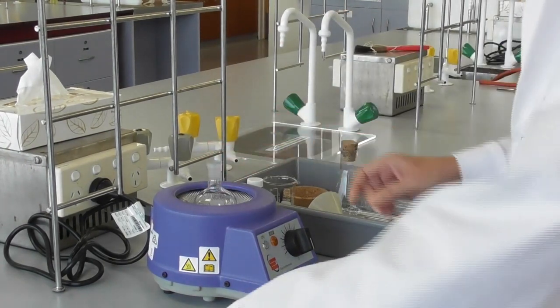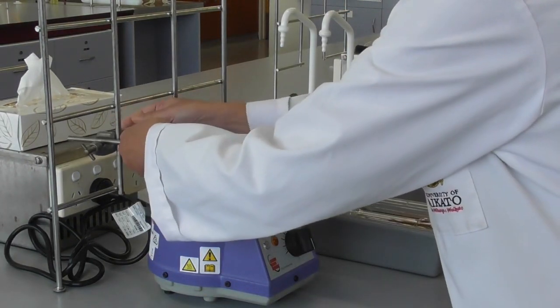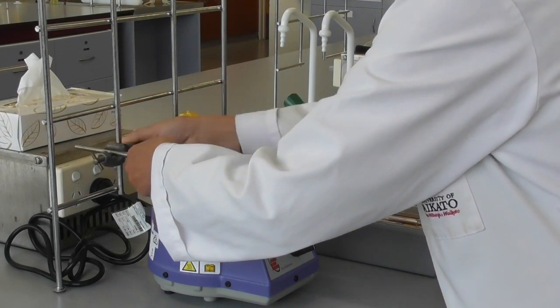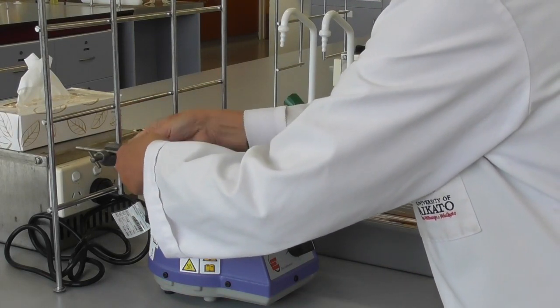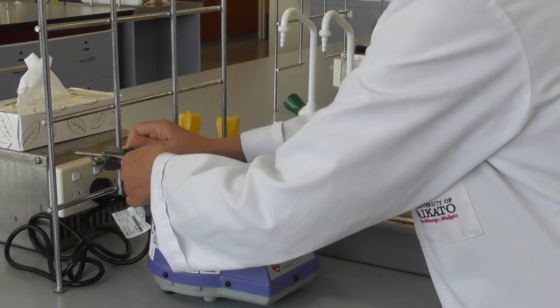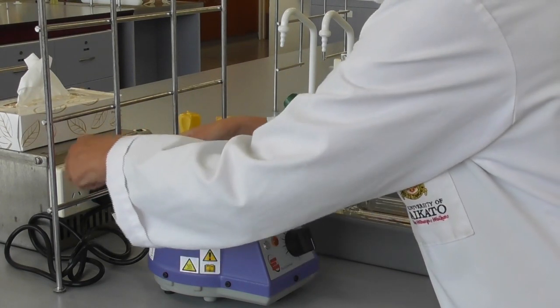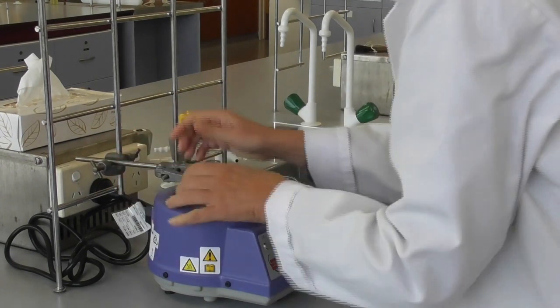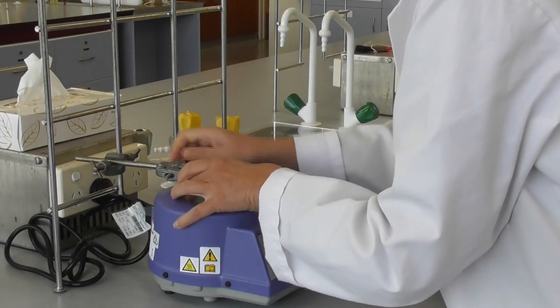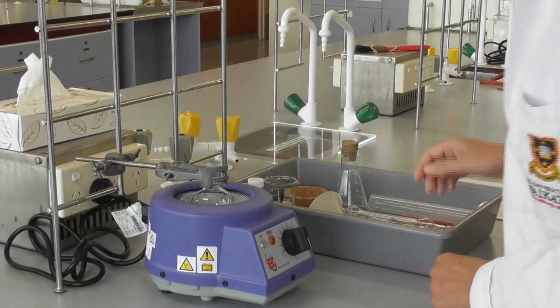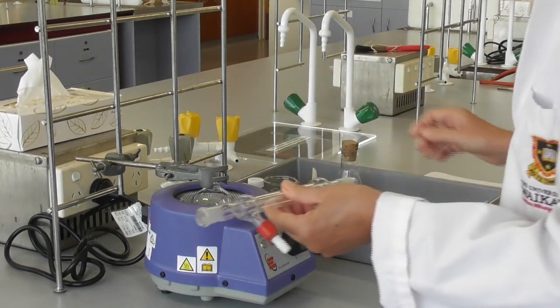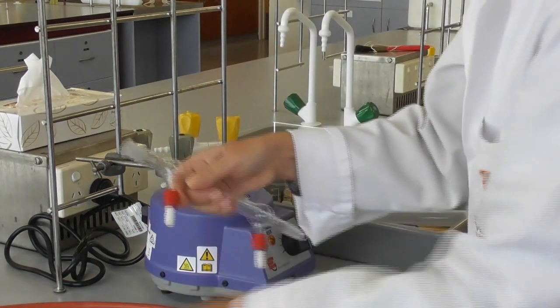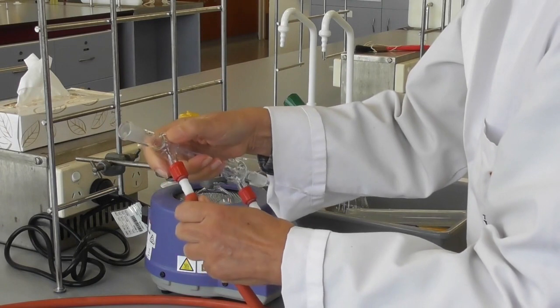We start this experiment by setting up the reflux apparatus. First, we clamp a 100ml round bottom flask to sit securely inside a heating mantle. It has to sit snug and be in touch with the surface of the heating mantle so the heat can be transferred into the flask.